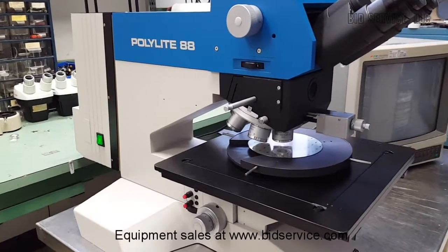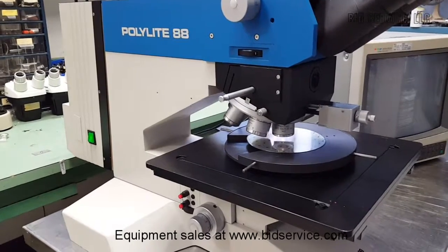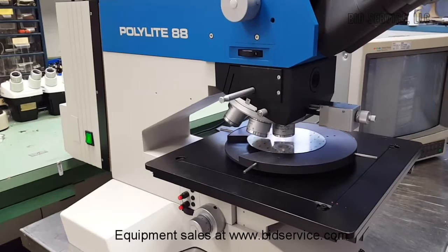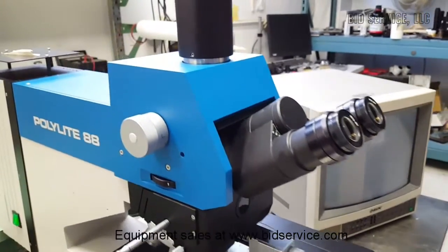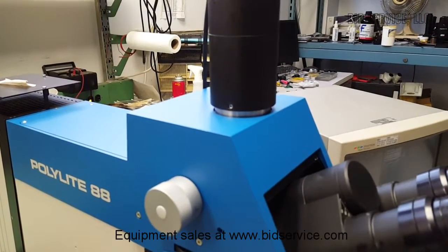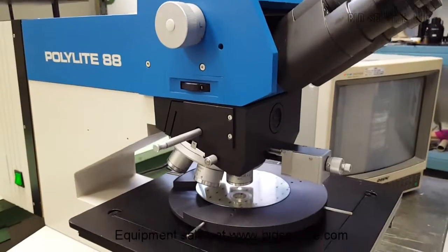This is the Poly Light 88 made by Riker Jung. It has 5x, 10x, 20x, 50x, 100x, and 150x objectives with 10x eyepieces. We installed a camera adapter — the camera and monitor are not included.